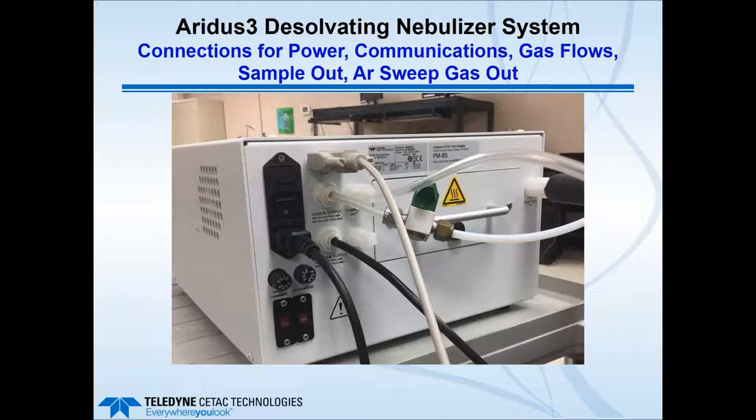In the middle of the picture, there is a little metal handle with a little heat sticker above it. That's the membrane desolvator modular block that can be easily removed from the system. And perhaps a later webinar will go over maintenance tips and other things for the Aridus3, but that's what that denotes. So there you see the main connections that you would do that are on the back panel of the unit.